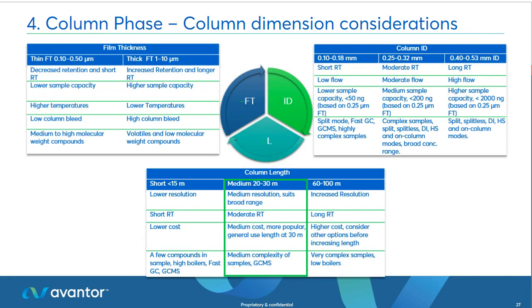When you have a look at column dimension considerations, it can seem quite overwhelming and there's too many choices, but if you break it down, you just need to ask yourself, what do I need to get out of this column? So let's have a look at length first.